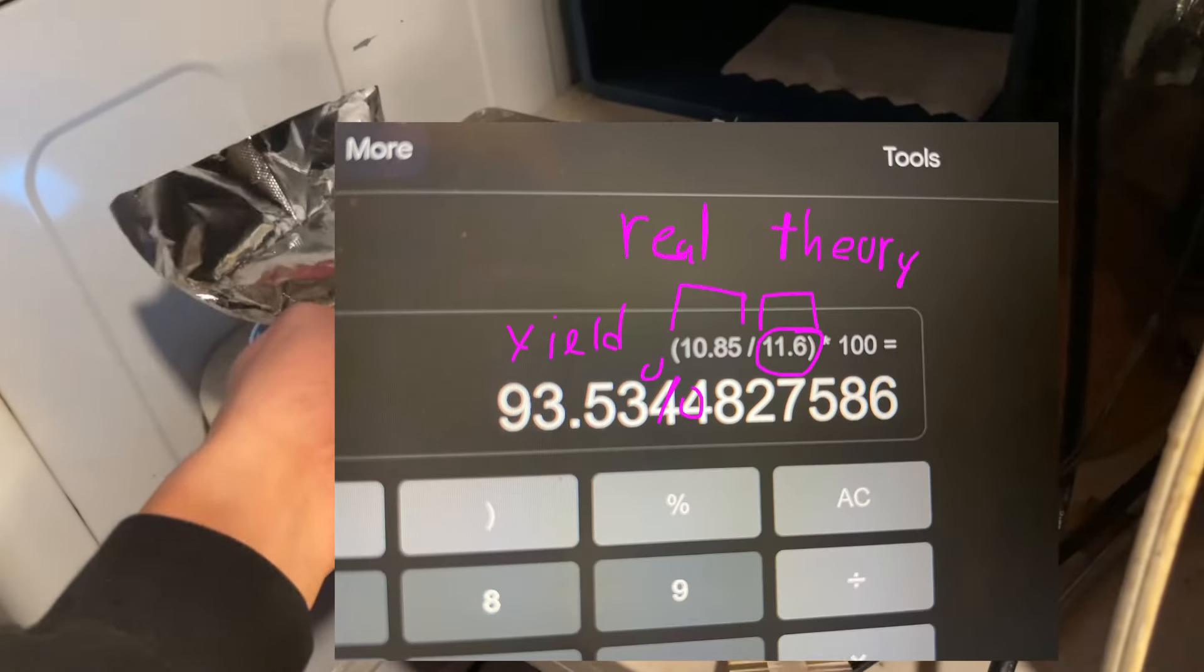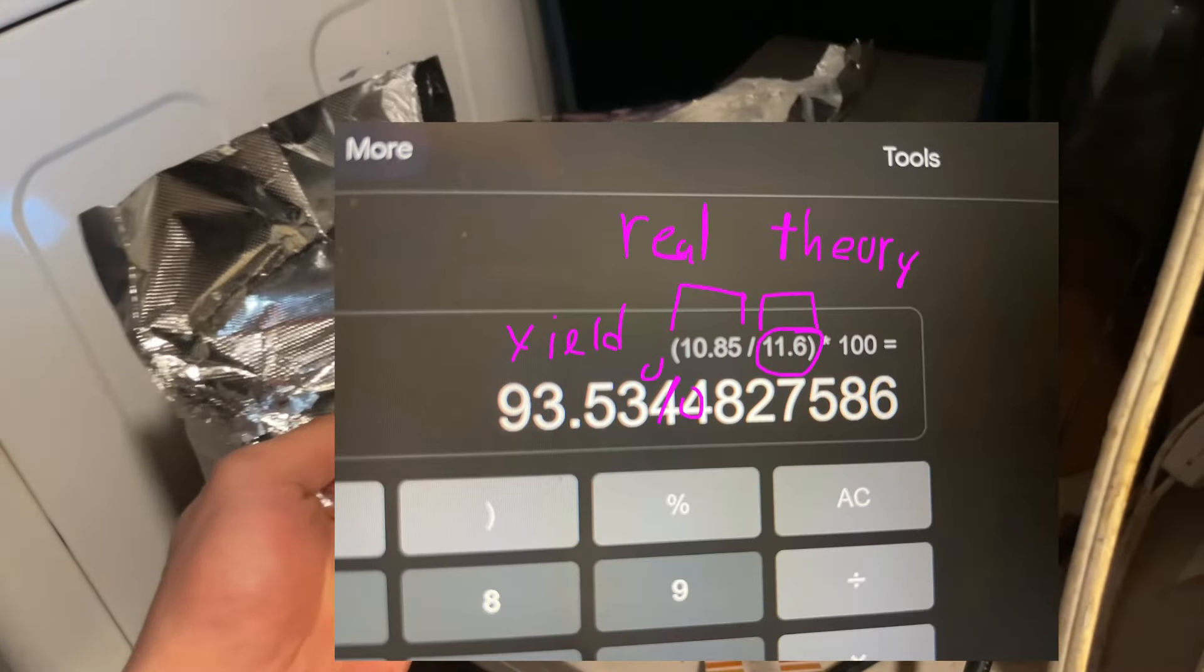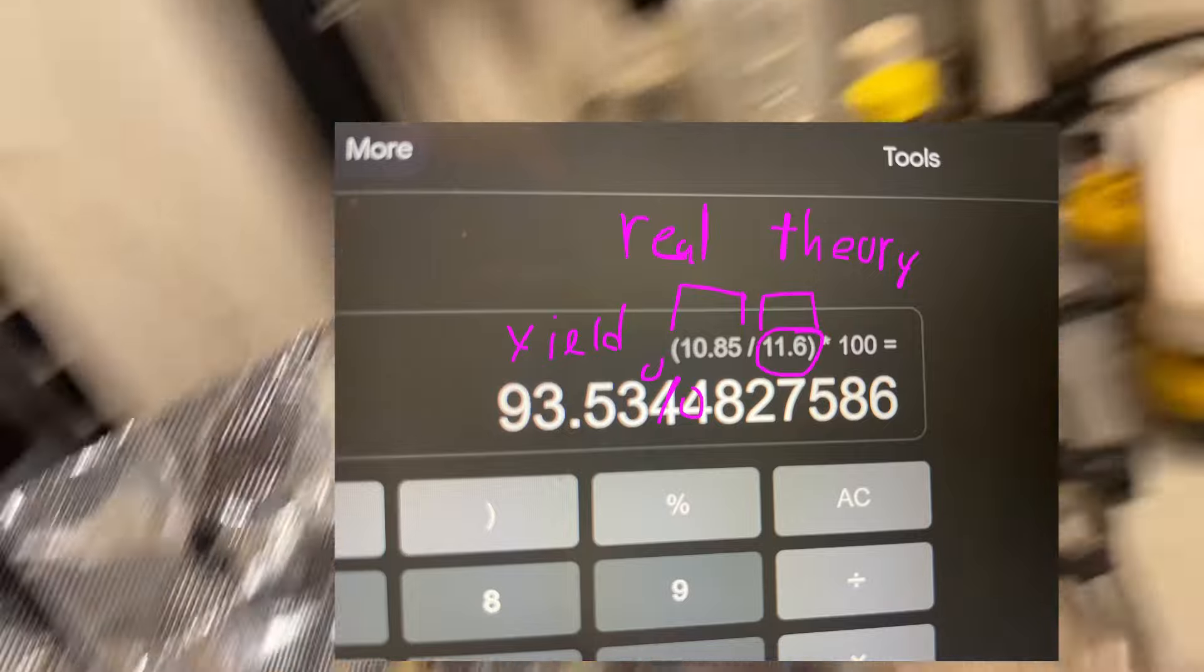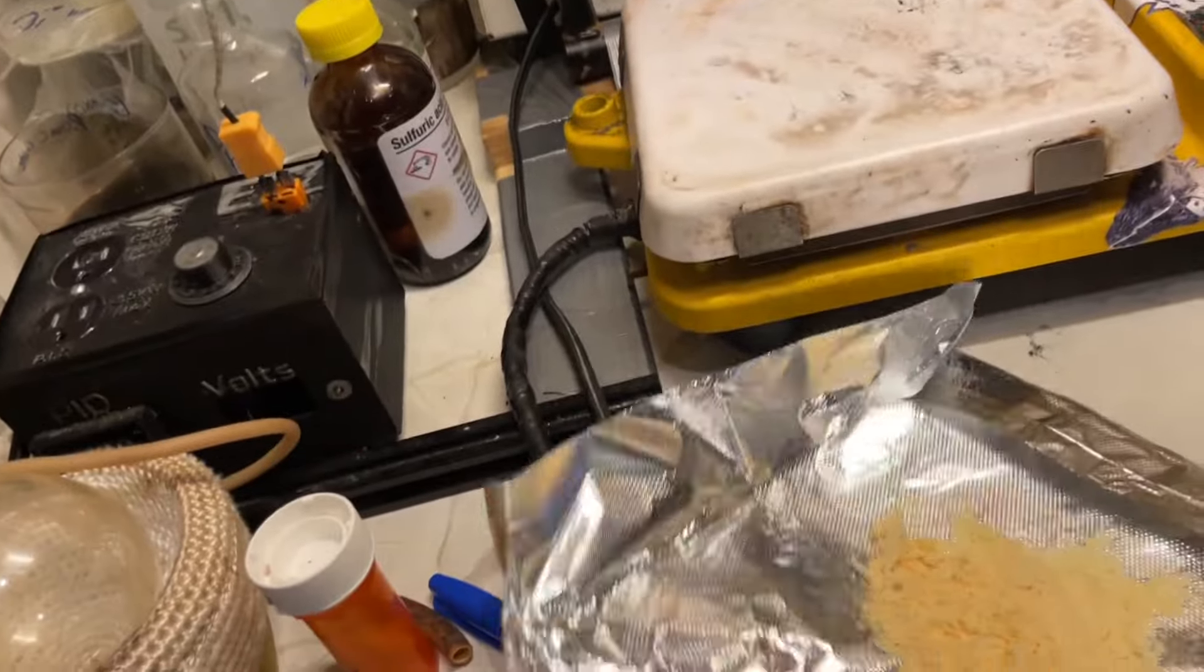Looks like cheese powder. On camera it looks more tan, but in real life it looks like the macaroni and cheese, like the instant ones. It looks like that cheese powder. We got 10.85 grams. I'll calculate the yield and I'll throw the yield up on the screen right now. That's how much yield we have. Depending on my reaction, amazing, wow, or miserable.